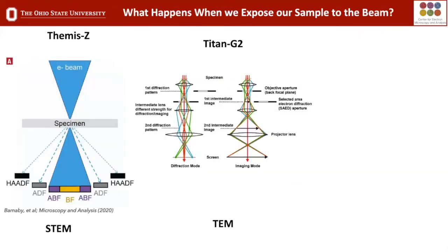So just briefly, for those that deal with TEM, we have STEM on the left, which is in the Themis Z. We're going to converge a probe down to a point and look at the diffracted beam through the sample and collect various diffracted signals, as you can see with these detectors. I'll show a couple of the images that you can get and you can expect for this.